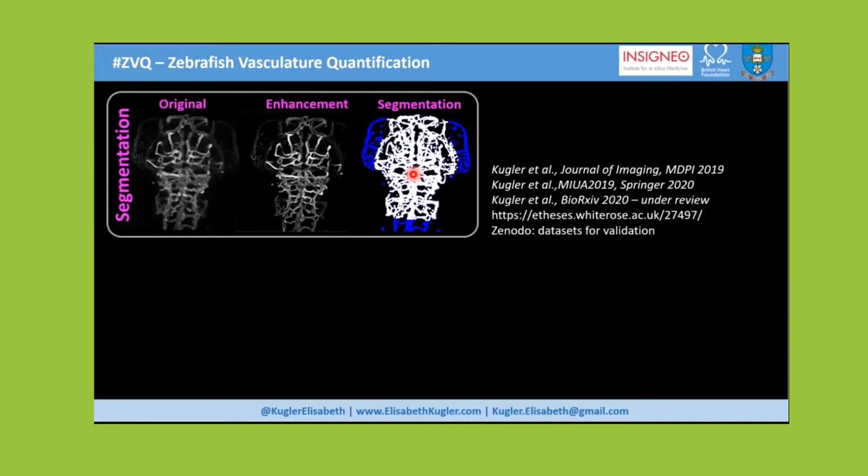In principle, now that we do have the segmentation, this is the foundation for any following quantification. What we build on this is examining how similar one fish is to another. But when we image them, they are not nicely overlapped, but at different angles.